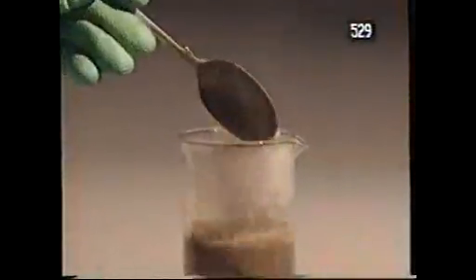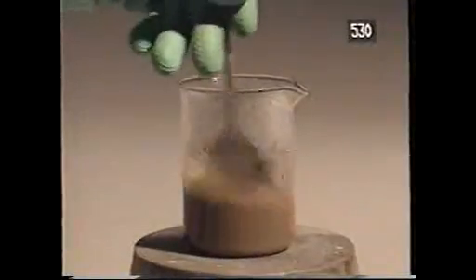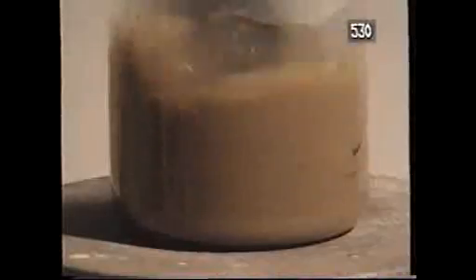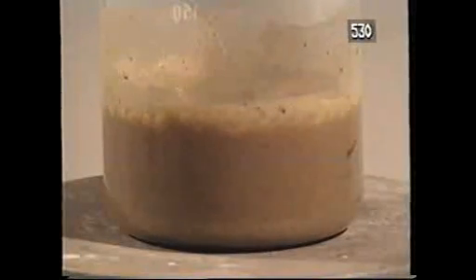What I'm going to do is to take some wood ash and add it to hot water. Then I stir, and next I shall filter it.